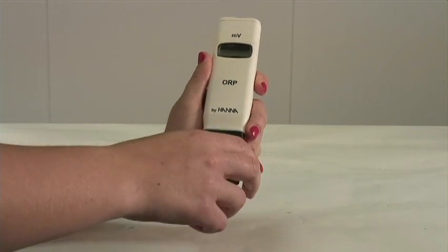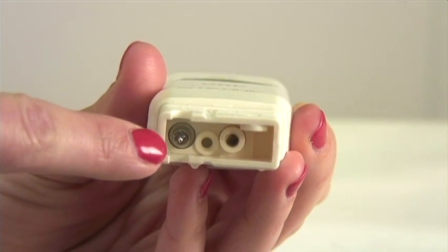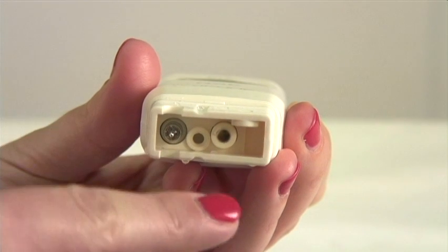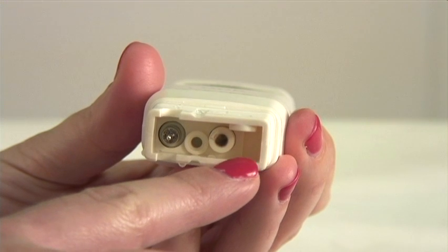When you take the cap off, you will see the ORP electrode and your reference junction with a cloth junction.